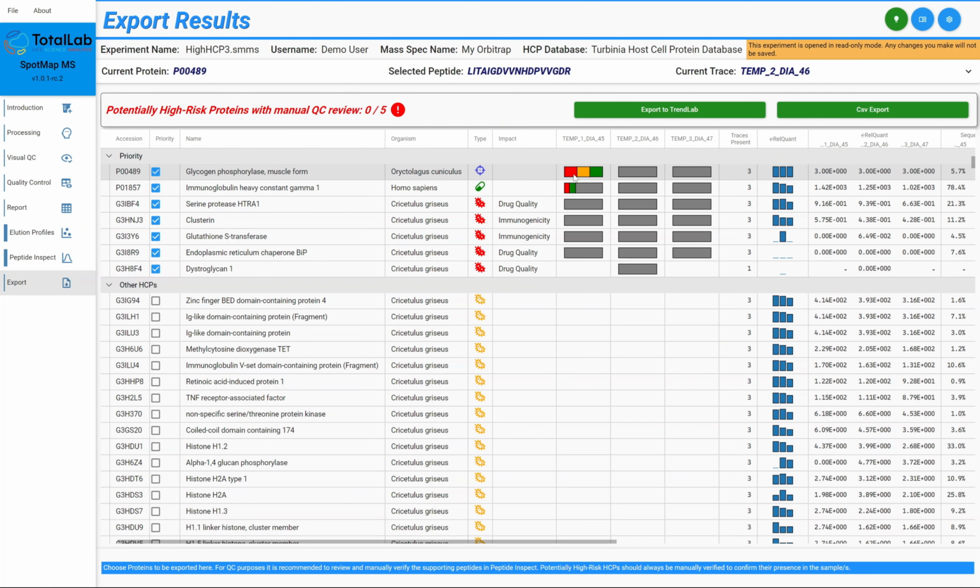And we've had a human look at the data quality to really confirm that it is present in all three of these traces. So we've got a number of checks and balances from a QC point of view to say the software's automatically detected it. We've had a human validate the detection and validate the data quality is high enough that we can make that assumption and say, yes, I think this is definitely present within each of our traces, or 2 out of 3, or maybe only 1 out of 3 is good enough quality.